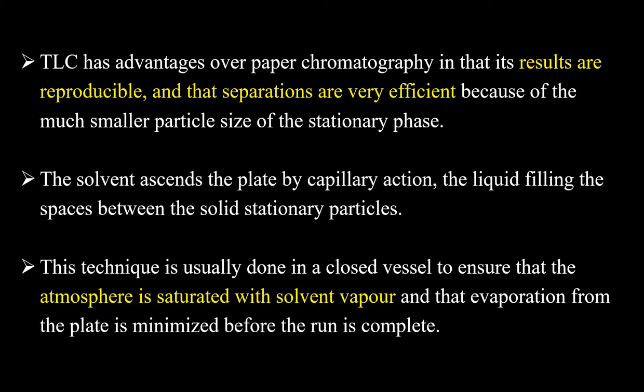TLC has an advantage over paper chromatography in that its results are reproducible. The separations are very efficient, and even the speed of separation, that is the time required, is less in TLC compared with paper chromatography because of the much smaller particle size of the stationary phase.